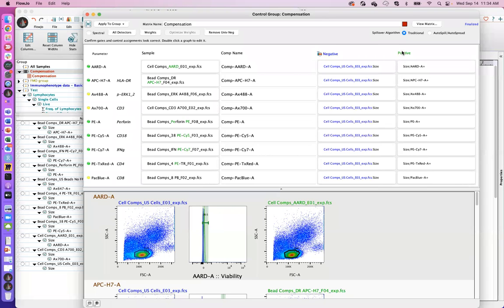Okay. Now for negative and positive. In traditional or conventional flow cytometry, which is what most of you are used to that are not using an Aurora, for example, for your acquisition, most other cytometers that are not Auroras use what we call traditional or conventional spillover calculations for compensation. Okay? And in that methodology, you have to define a negative population and a positive population.